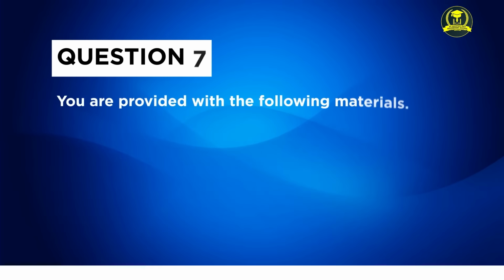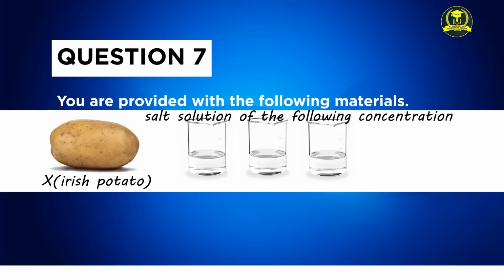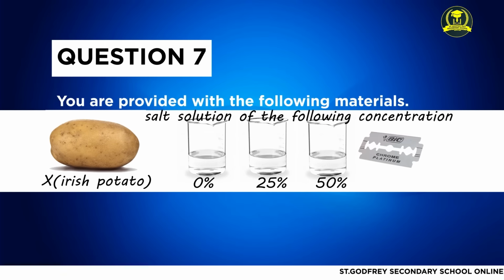Question number 7. You are provided with the following materials. Number 1, specimen X, which is Irish potato. Number 2, salt solution of the following concentrations: 0%, 25%, and 50%. Number 3, a razor blade or a scalpel or a knife.